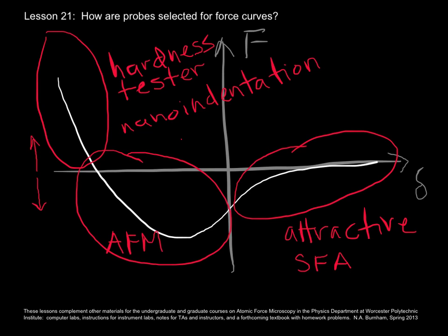So this is very good for thin films and any application where the surface is very important.